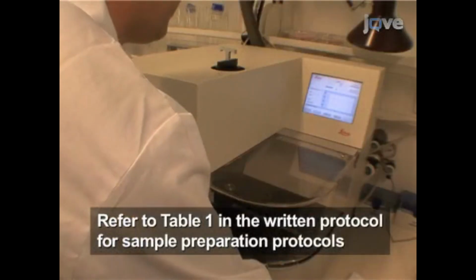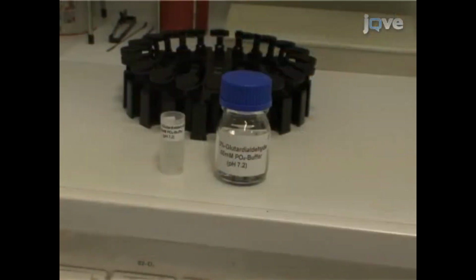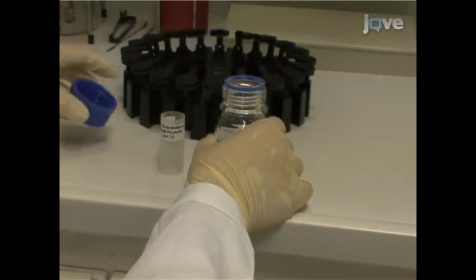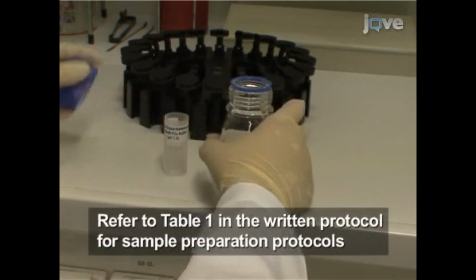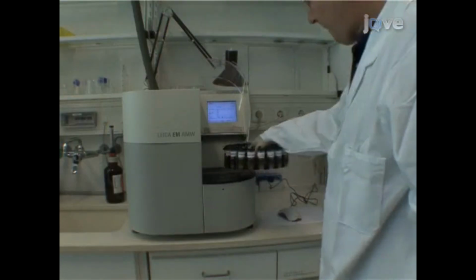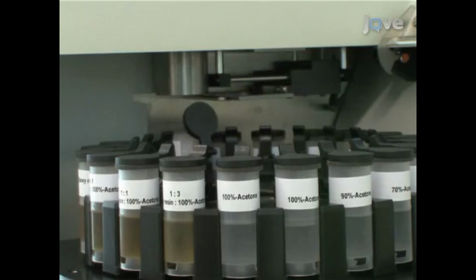Before the start of sample preparation, program the automatic microwave tissue processor for electron microscopy, Leica EM-AMW, with the appropriate protocols. Prepare the solutions for the different steps described in the programmed protocol for fixation, dehydration, and infiltration, and fill them into the designated vials according to the protocol. Load the vials on the carousel. Insert the carousel into the microwave tissue processor, and then load the first vial into the monomode chamber.